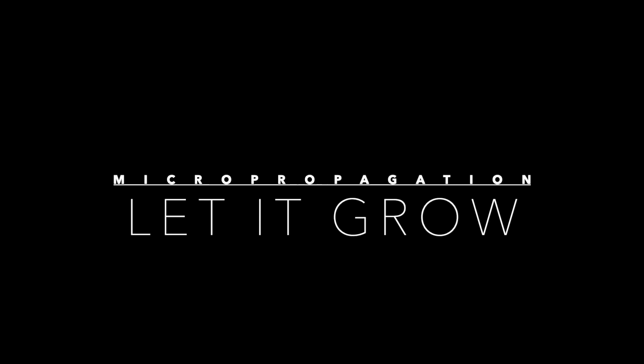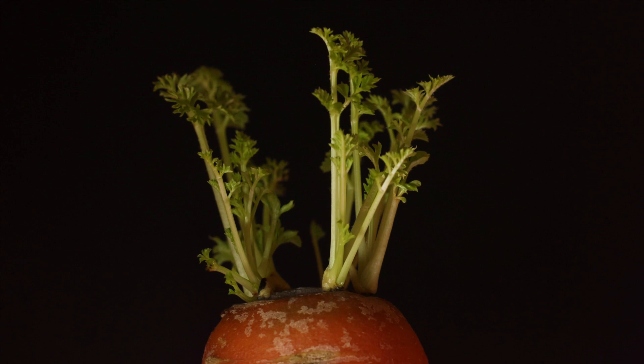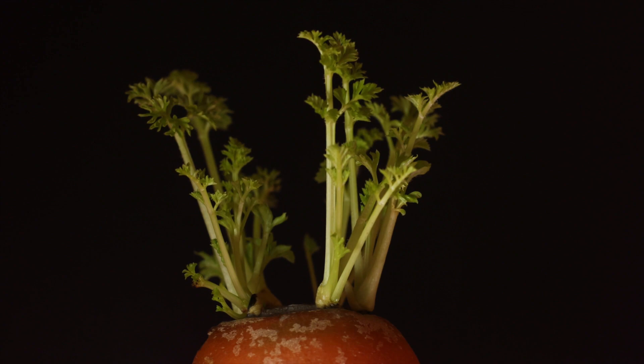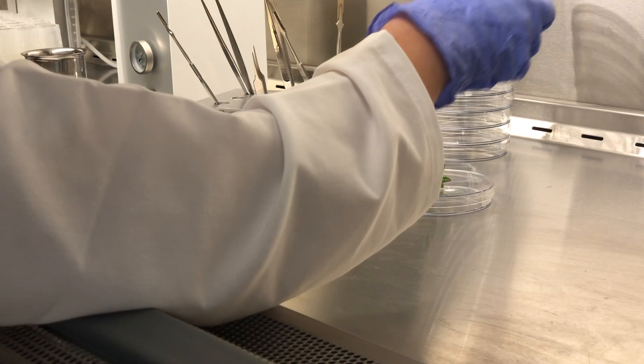We'll give each plantlet time to grow. Last month I placed some more tomatoes and other plants into tissue culture, and some of them have gotten pretty big now.